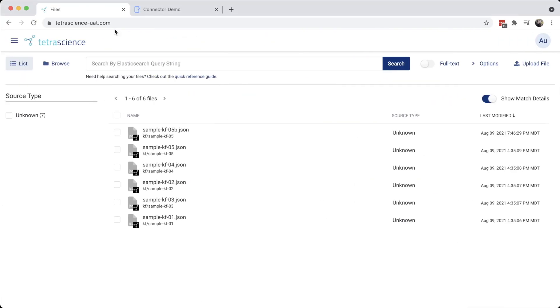First, we'll take a quick peek at what's in the data lake here. I've prepared some harmonized IDS files containing water content data. These would be the output of the first phase of the data flow.